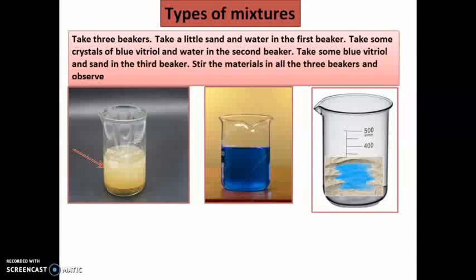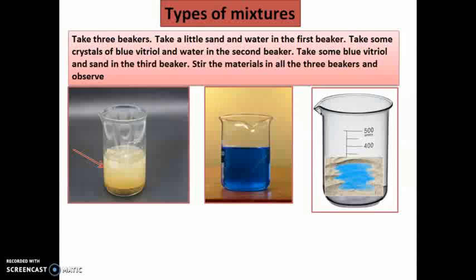Now moving to the types of mixtures. To understand mixtures, let's carry out this experiment. Three beakers are taken. In the first beaker, we have sand and water. In the second beaker, we have crystals of blue vitriol and some water. In the third beaker, we have two solids: blue vitriol and sand. We are stirring the material in all three beakers with the help of a glass rod.